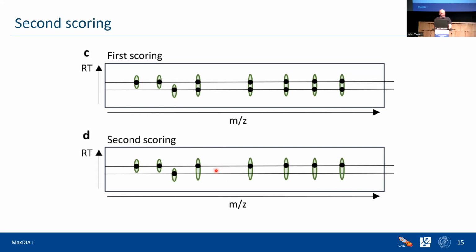So the tricky thing about this is that if you do this wrong, then you won't notice this in target decoy search, because the target decoy search is blind to this mistake, essentially, because you're always reverting both of them simultaneously, so you don't see that one of these assignments is wrong, basically, right? So that's very dangerous. Because even with external FDR and other kinds of validation of your data, you would actually not pick this up. Right?